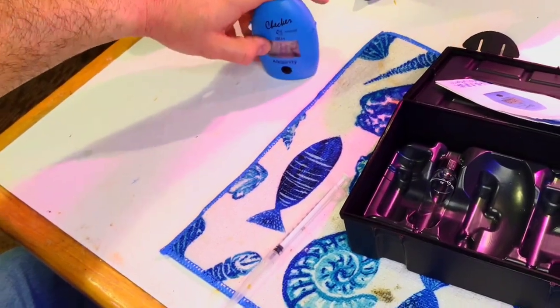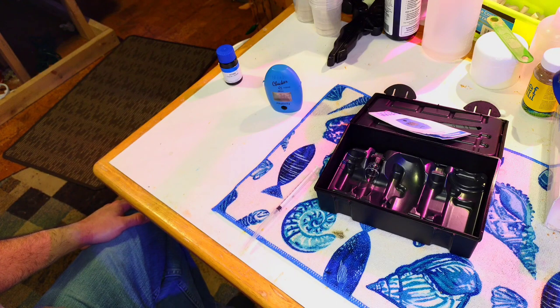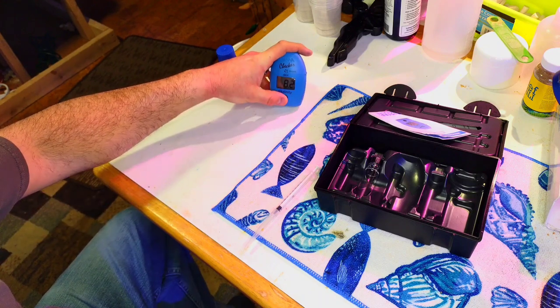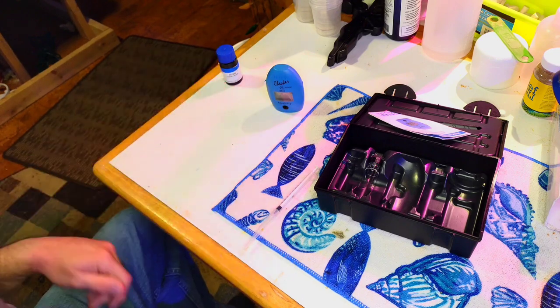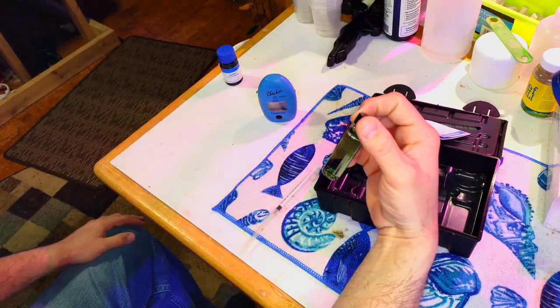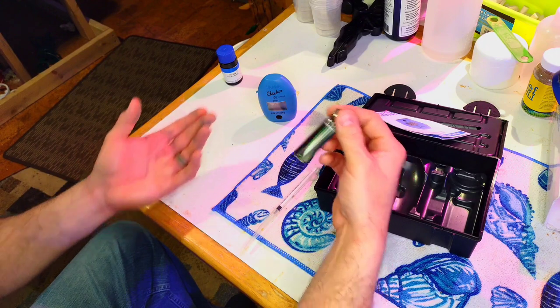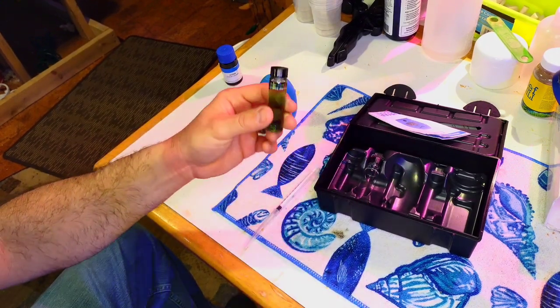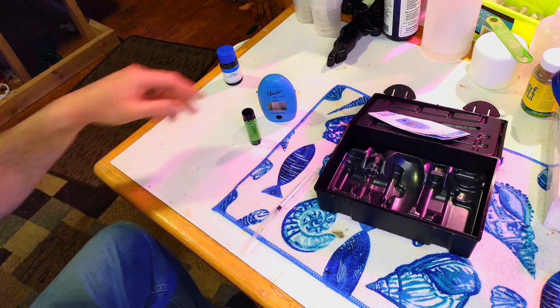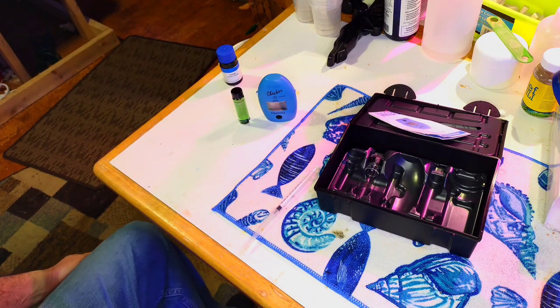This tank reads 8.2 dKH — not bad. I don't need to make any adjustments on that tank just yet; I'll probably dose it tomorrow, but that's a good number. To turn it off, just hit the button again or hold it in. You don't want to leave the sample in for more than about 10 minutes since this is a dye and it can stain the glass and affect future readings, so rinse it out as soon as possible. You can also keep extra cuvettes.